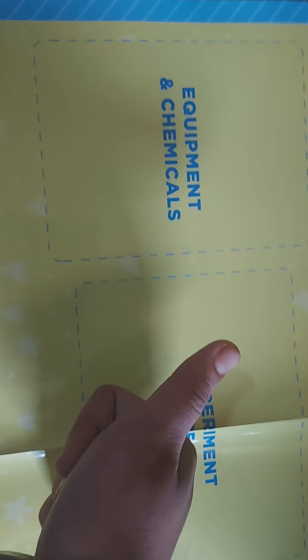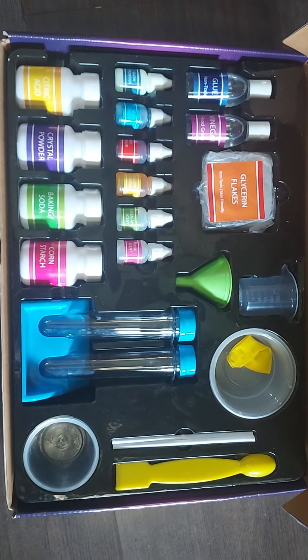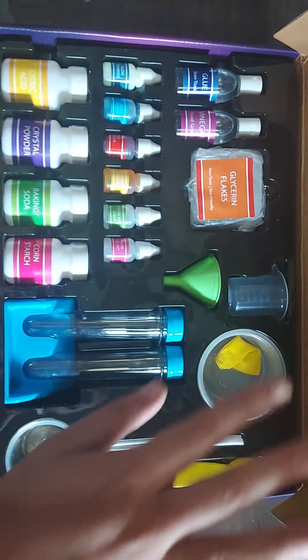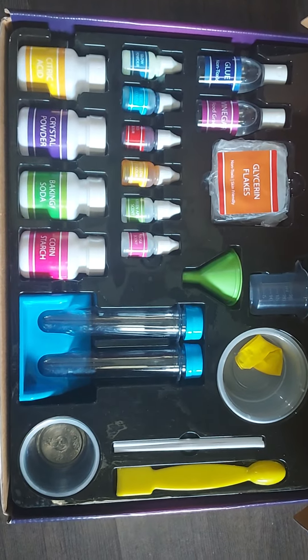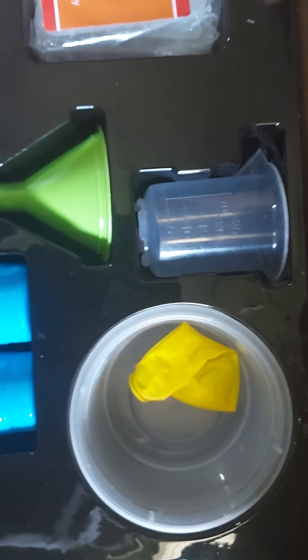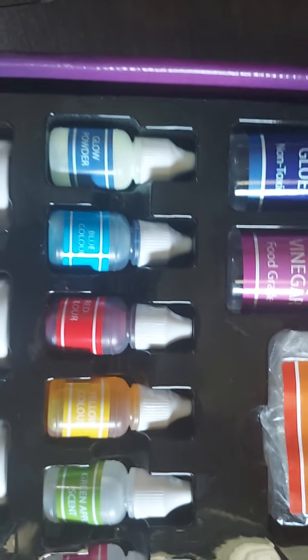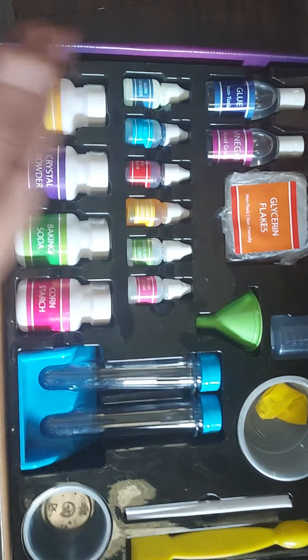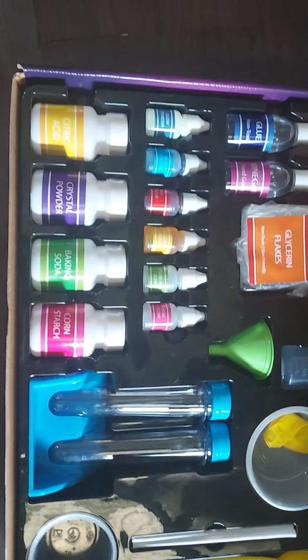Here is the overall view of the kit from inside — there are very many things. I will show you each one closely. This was the overall view, and now we'll go through the name of each item.